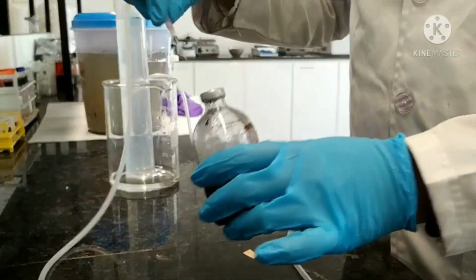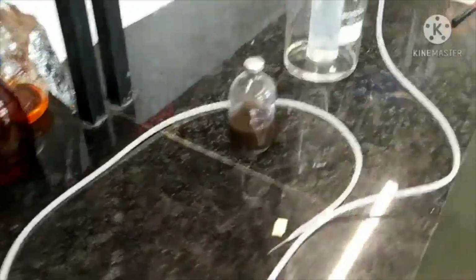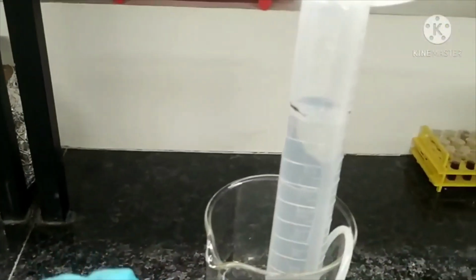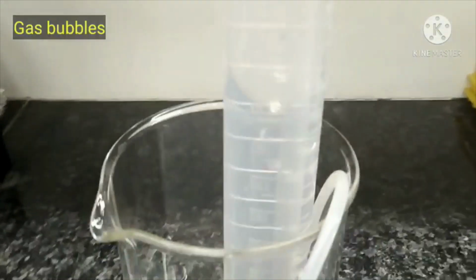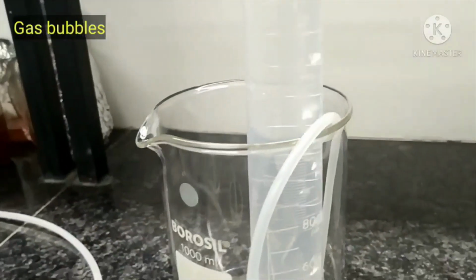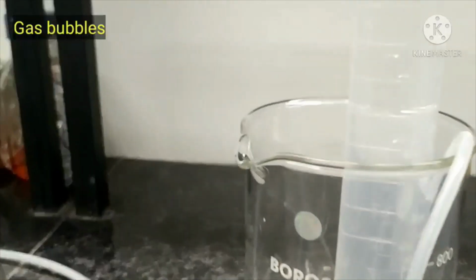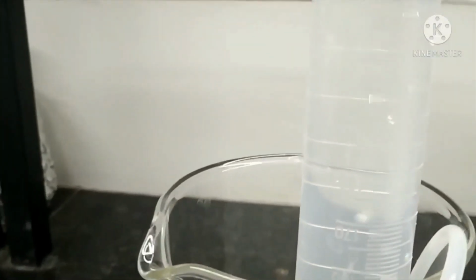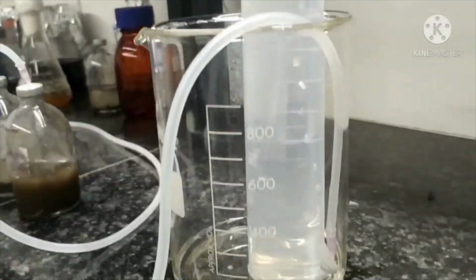So we will just add in this and find out how much is there, and how the gas is coming out of it, and we are inserting. Continuously you can see.